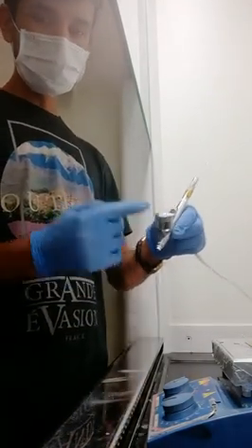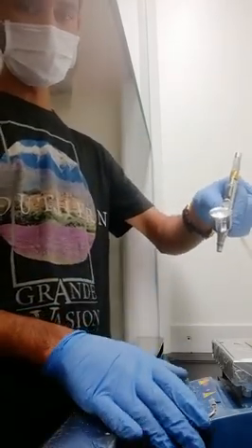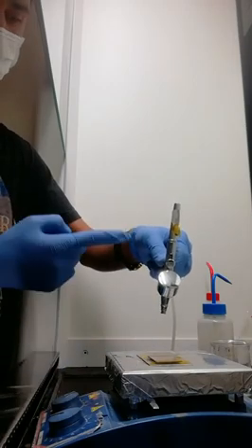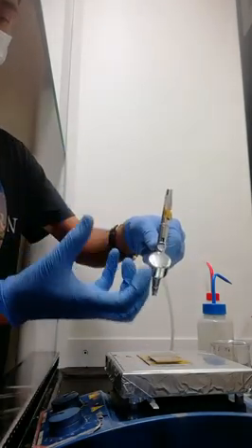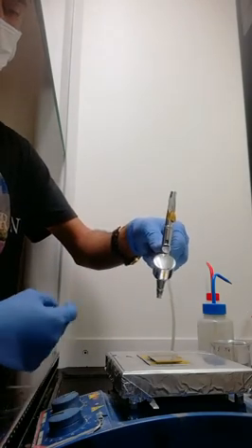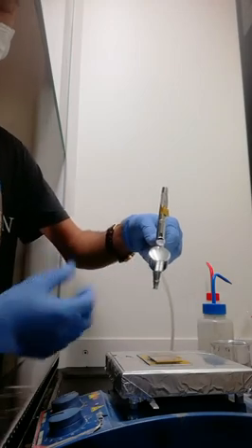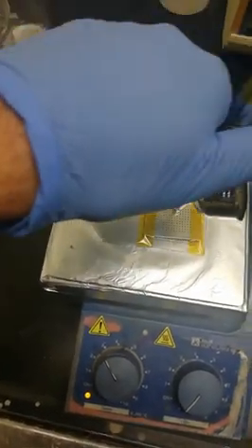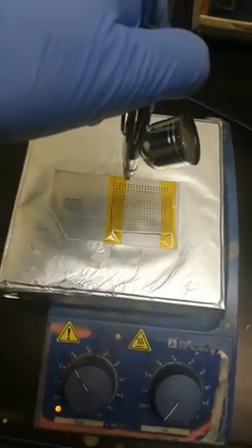Once you fill up your brush with the silver nanowire solution, you have to place your brush perpendicularly on your mask. Hold the solution and spray coat until your shadow mask gets white. You have to go zig-zag over the mask.